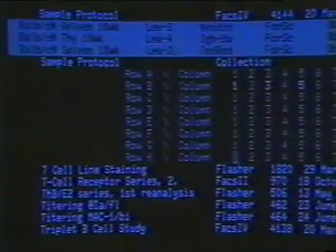If you execute a well to view its label, then choose not to collect data, you can press line feed to cancel your first execute command, thereby making the label disappear. If you have a technical problem while collecting data for a sample, you can abort the collection by pressing Enter Execute. There is no need to worry about collection interruptions.